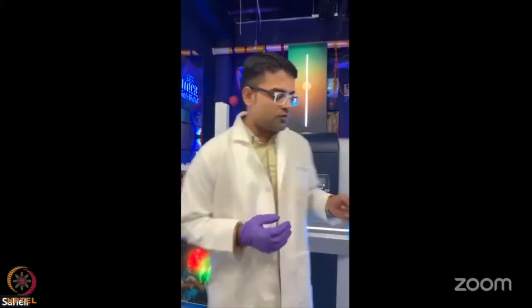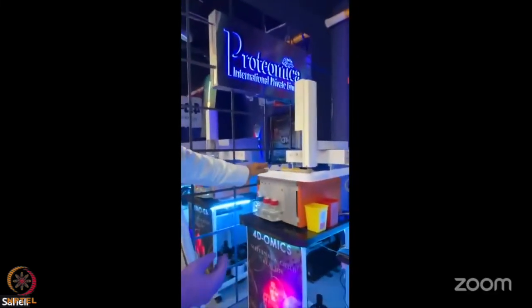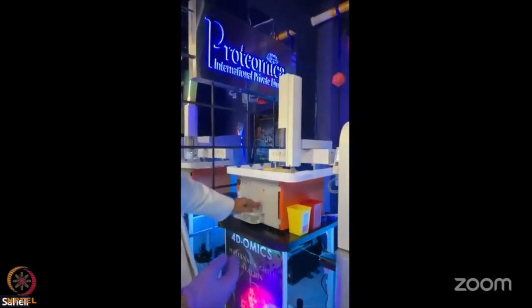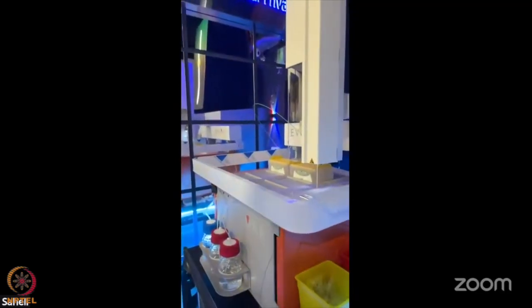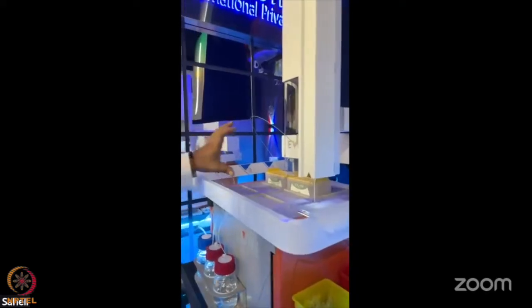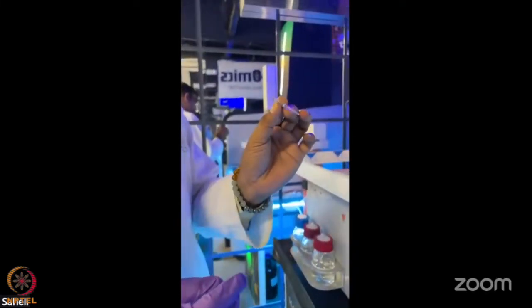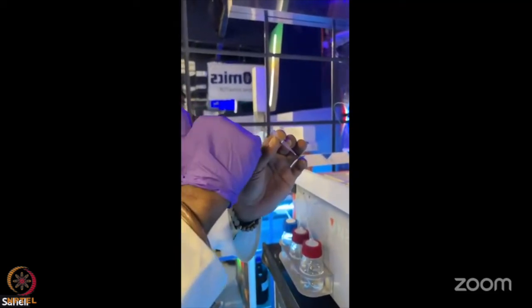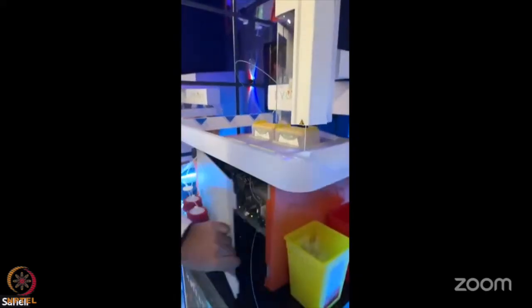This is the timsTOF Pro instrument coupled with the EvoSep Nano LC. This EvoSep Nano LC is one of the cutting edge revolutions in the world of Nano LC. Here you don't have to keep different samples. You just have to put these tips, which are Evo tips. You directly load the samples and the samples will be directly eluted. Rest all the things are like the general things.